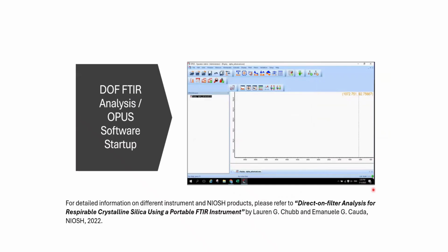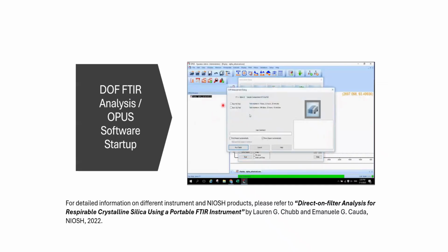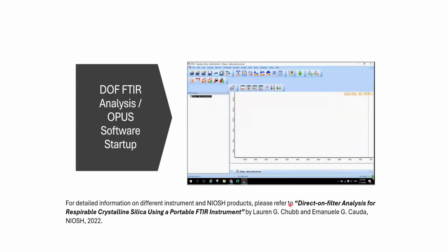So we will click on that yellow circle and check to see if one of those measurements expired. If so, open and run the expired tests, and it should pop up some web pages, and it should say all tests passed, and then you will be good to go. And check the relative humidity to make sure that it is below 30%.